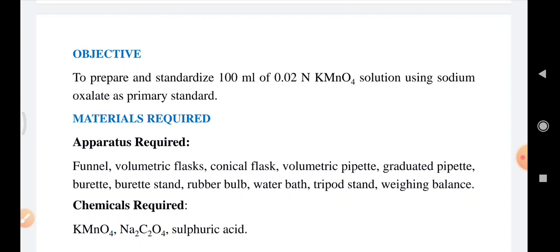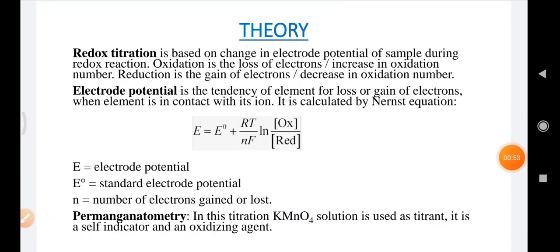The apparatus required are funnel, volumetric flask, conical flask, volumetric pipette, graduated pipette, burette, burette stand, rubber bulb, water bath, tripod stand, and weighing balance. The chemicals required are KMnO4, sodium oxalate, and sulfuric acid.